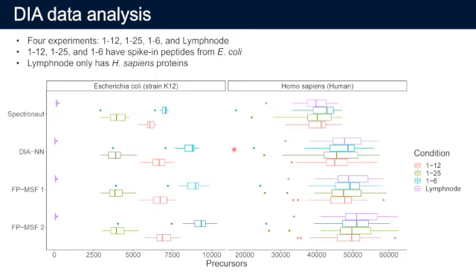An interesting part is that with both DIA and DDA, we can quantify even more compared to DIA-NN and Spectronaut. And the other experiments also show that combining DIA and DDA data together to build a spectral library will always result in more quantified peptides and proteins from the DIA data. And this is work under submission.